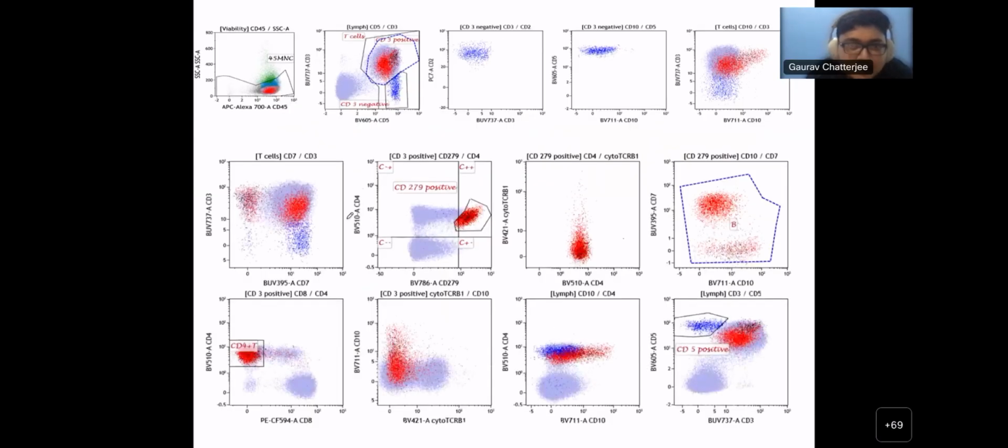Oh, that's done. And I now look for T cells, right? So T cells, again, we saw that the same population that we saw, no? Like surface CD3 positive. This red population, please focus on them. They are CD4 restricted, as you can see here. A little bit of CD10 is positive, like we saw in the bone marrow. CD279, this is basically PD1, another follicular helper marker. That's very brightly positive, right? Very nicely positive.